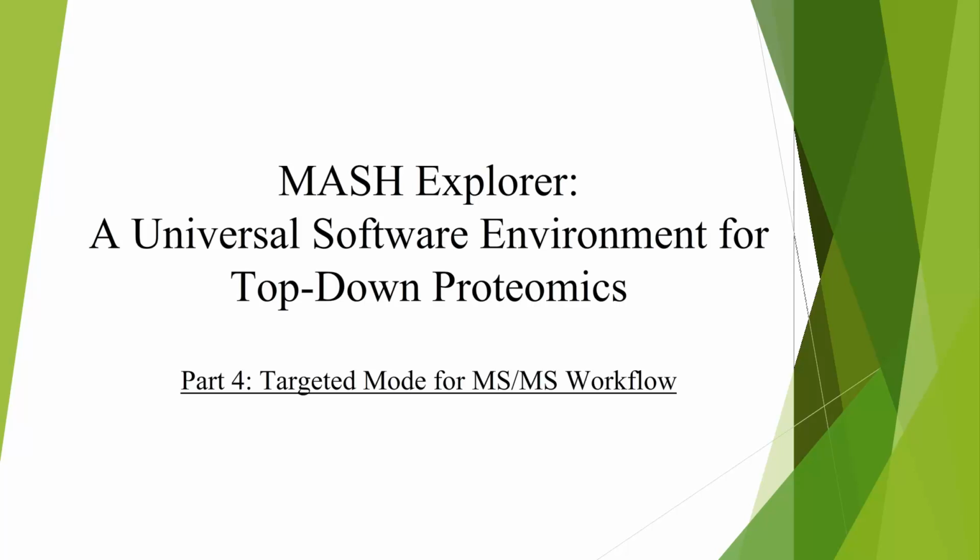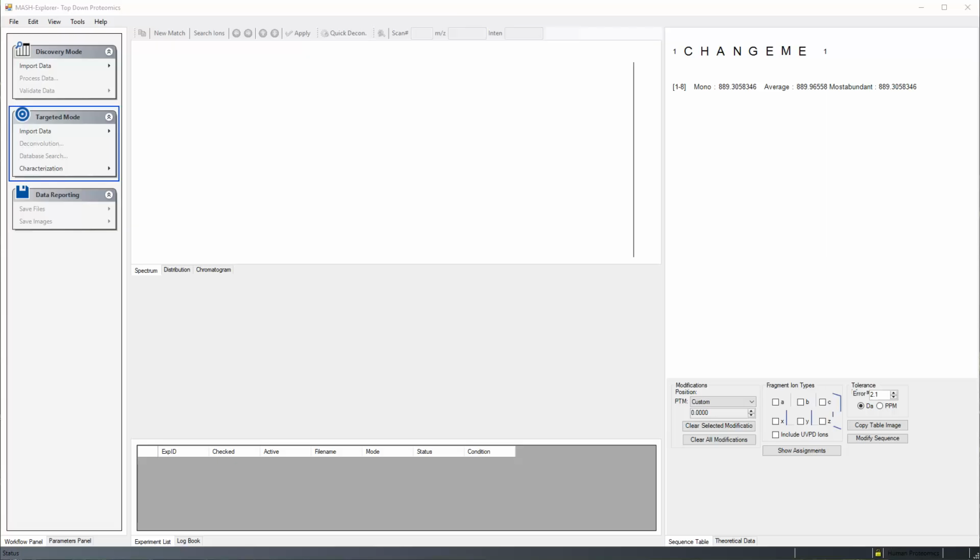In this video, I will be showing you how to use targeted mode in the Workflow and Parameters panel. Contrary to discovery mode, targeted mode workflow is used for comprehensive protein characterization. This workflow includes import data, deconvolution, used for spectral deconvolution to identify fragment ions, database search based on identified ions, and finally protein characterization. This workflow aims to perform identification of fragmented ions that describe the protein sequence and identification and localization of post-translational modifications of a target protein sequence.